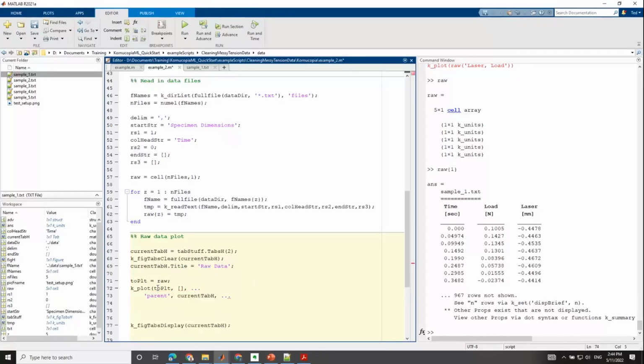And now we're going to specify the independent data. The real word is independent call, but we can type short as we've talked about before. So that's the laser. Now, let's say I type laser with a lowercase l, not an uppercase. Column names are case sensitive. I'll show you a feature that Kornucopia has to help you with this a little bit.